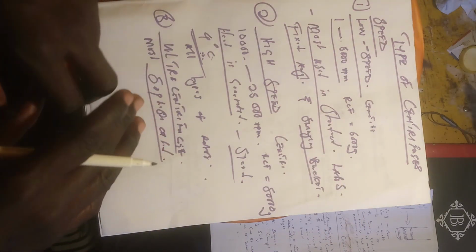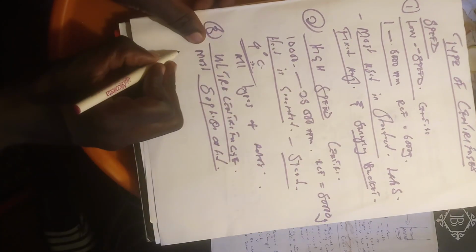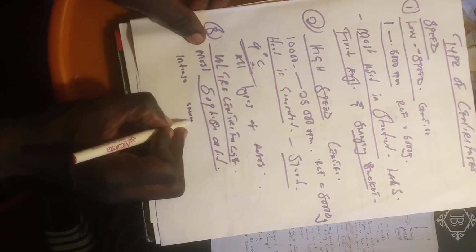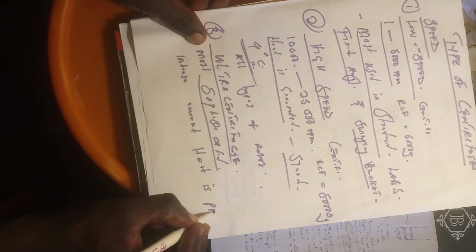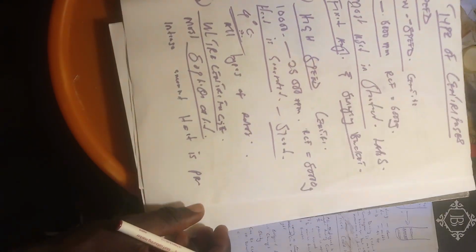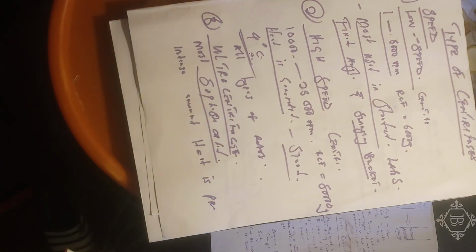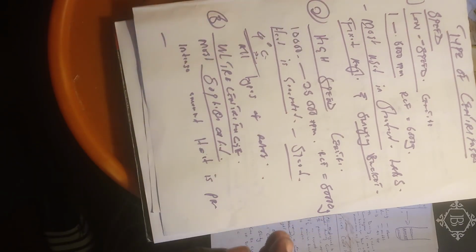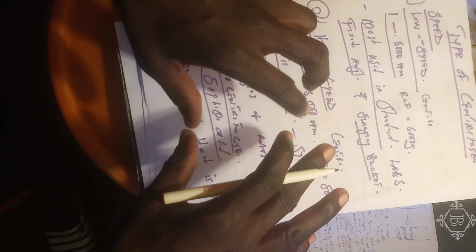It uses very, very, very high speed, and because of that, an intense amount of heat is produced in this type of centrifuge, and due to that, an internal rotor chamber refrigeration system is mounted in such a centrifuge.